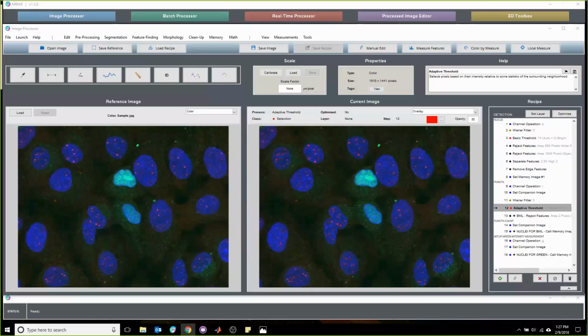Sure. As a former grad student, postdoc, and research staff member at Ohio State University, I definitely know how overworked we all are, and having a computer churn out some results while you're getting some much needed rest is valuable in and of itself. And you guys are also doing some really cool things with the data that MIPAR spits out. MIPAR really today, at least, is a data retrieval tool from images. And you're doing some really great things correlating some of that microstructural information back to mechanical properties of the material to figure out what some of those relationships are.